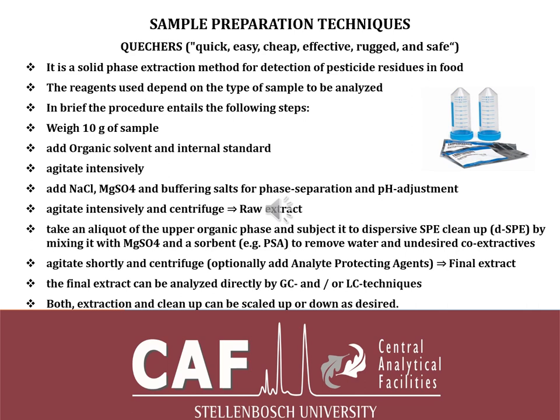And also you agitate, and then you can take that liquid, you can concentrate it up to a certain level, and then you can do a lot of other sample prep from there if it has to. And when you've got that liquid, you do a GC injection, you can do a liquid injection.